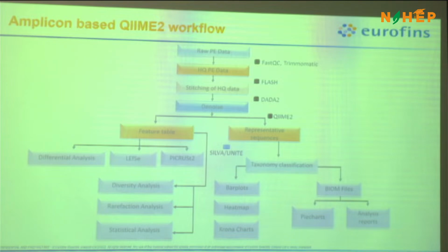These are new tools which have been developed which can do the functional. Earlier, if we wanted to do functional analysis, we could not use amplicon-based methods. But now we can have a superficial idea of the functional through 16S as well, using PICRUSt2 or Tax4Fun, which gives you functional analysis and KEGG pathways. The difference between metagenomics and 16S is that in 16S we are capturing a particular region.